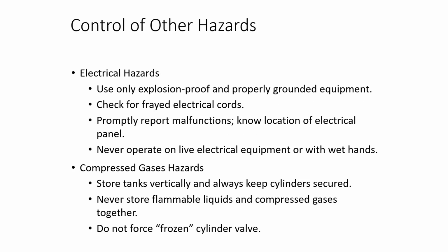Control of other hazards. Electrical hazards: use only explosion-proof and properly grounded equipment. Check for frayed electrical cords. Promptly report malfunctions. Know the location of the electrical panel. And never operate on live electrical equipment or with wet hands. Electrical hazards may seem like they're not going to occur in clinical chemistry, but you are using analyzers, and those analyzers are connected to electricity, and you are often adding wet reagents, solvents, and buffers to them. So electrical hazards are pretty commonly encountered.